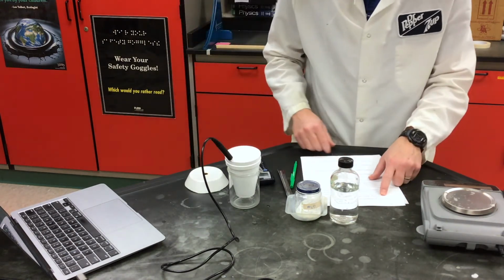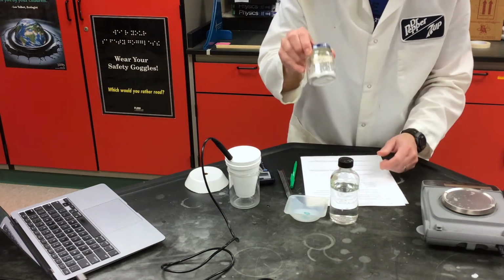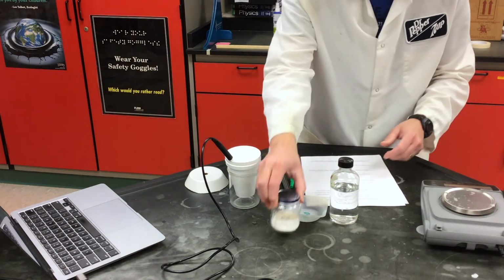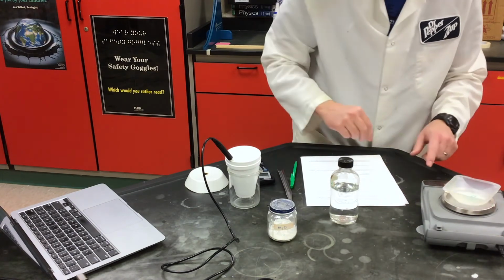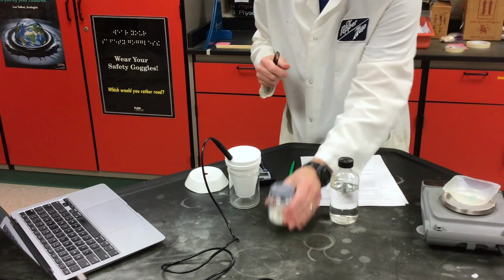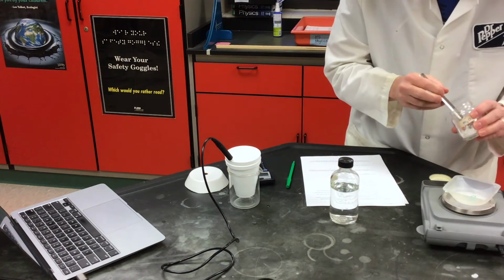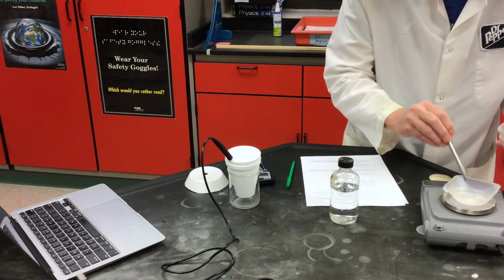All right, now I'm ready for step 2. Measure 0.35 grams of magnesium oxide. Magnesium oxide is like a white powder. So I'm going to put my weigh boat on the balance, and then I'm going to measure as close as I can. It does not have to be exactly 0.35, but I want it to be pretty close.